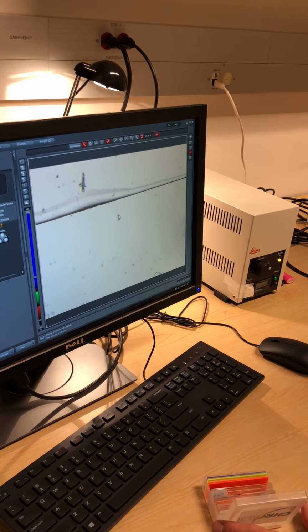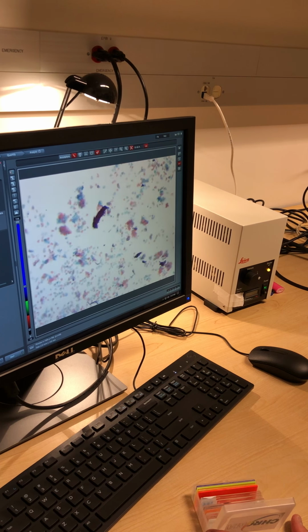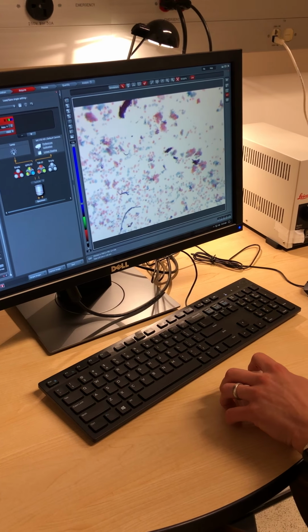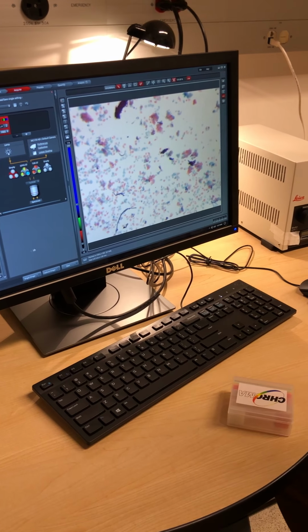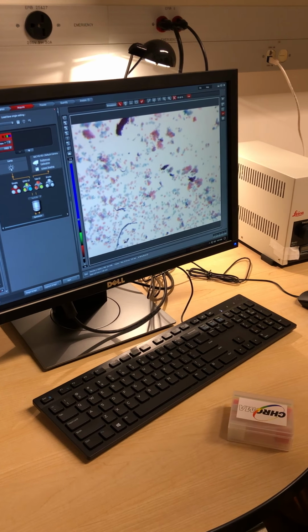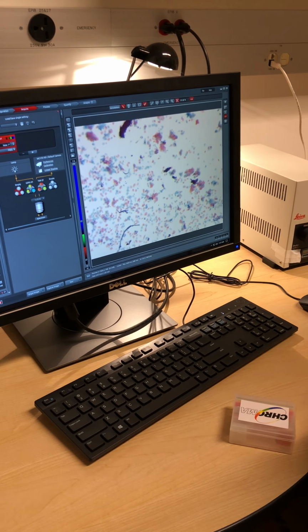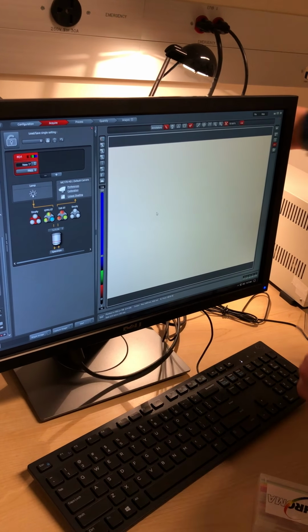I get it. It's nice because you have the stereo image. Yeah, there's some depth and the depth of field. Looks like terrazzo. But in that case we will need a different light source. Yeah, if you have illumination from above, you can look at some opaque things. Oh, actually, we can use that. I was thinking about that light. I didn't notice it until right now. Yes, we can totally jury-rig that. That's cool.